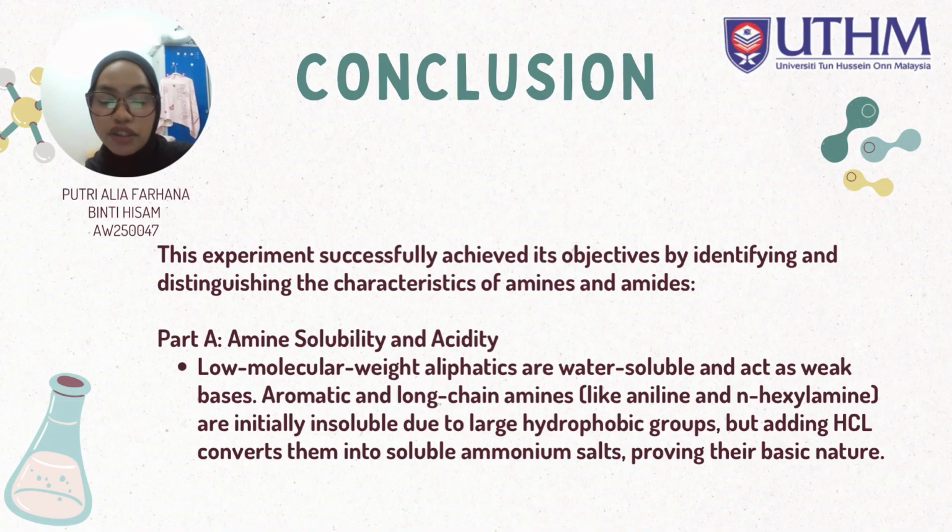I'll be talking about the conclusion for this experiment. So, for this experiment, we successfully achieved its objective by identifying and distinguishing the characteristics of amines and amides.